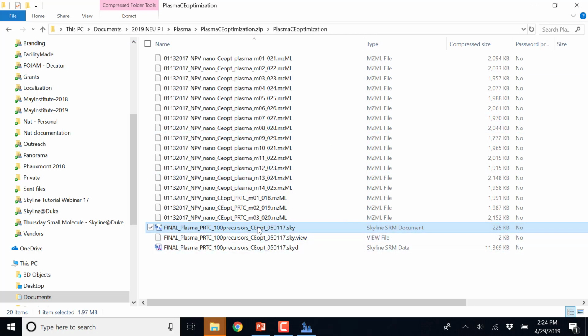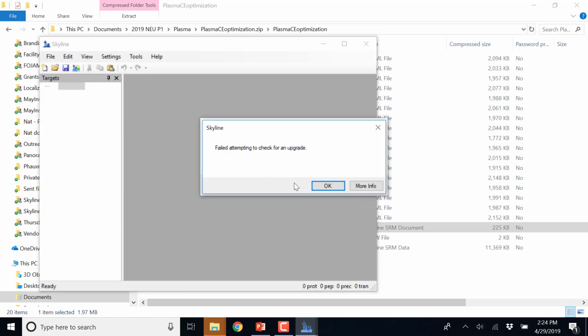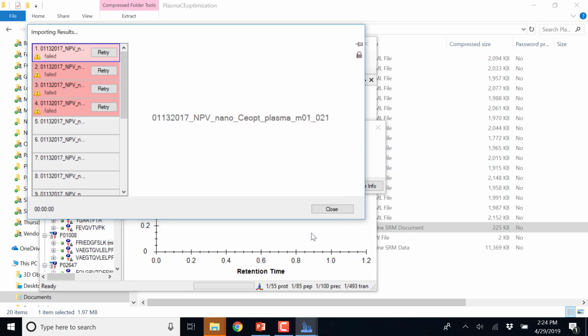Let's try that again. Open, just hit open. Oh my gosh, okay. We should make everybody report that error because it'll go ping Brendan right now.